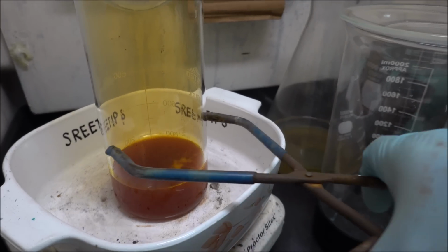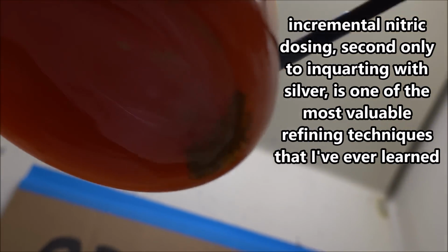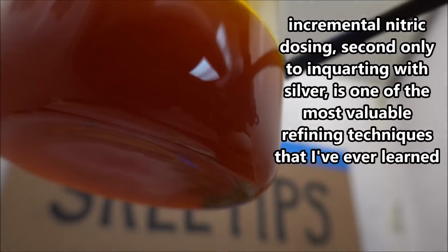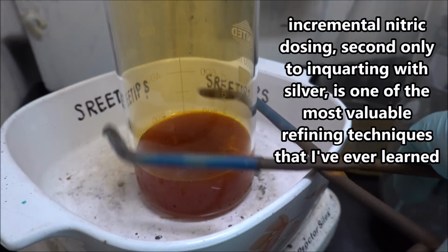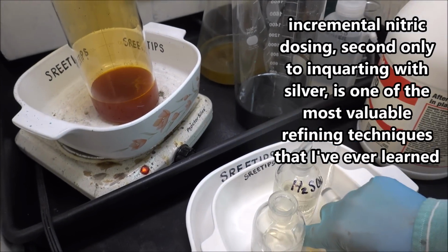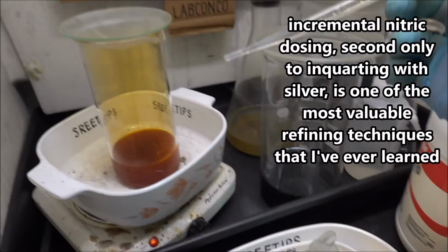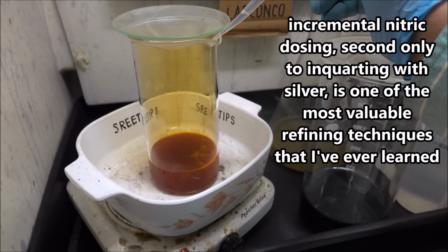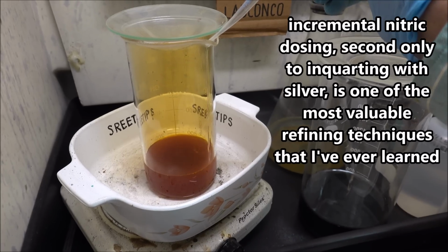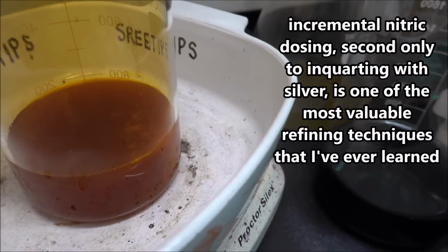It's been on here about 15 minutes now. Check the bottom. You see there I got a little bit of undissolved gold left in that solution. So I'm going to put it back down here on the heat. I'm going to get a little bit more nitric acid here. Not much, just maybe half an ml here. And I'm going to just drain it in on top of that gold. And that should dissolve the rest of it.